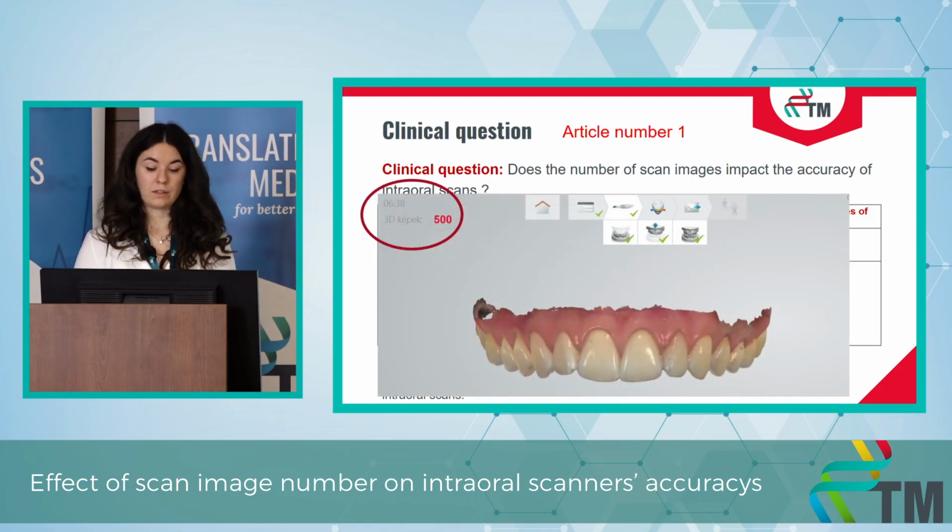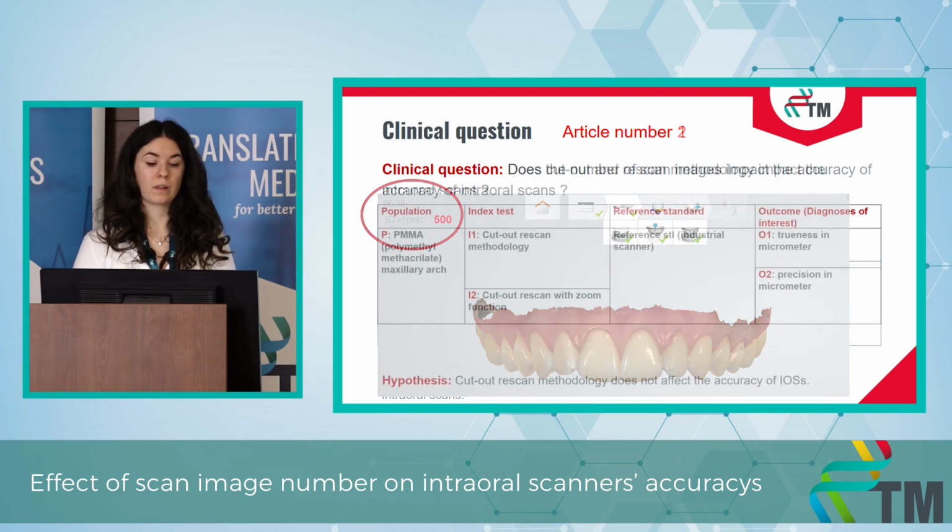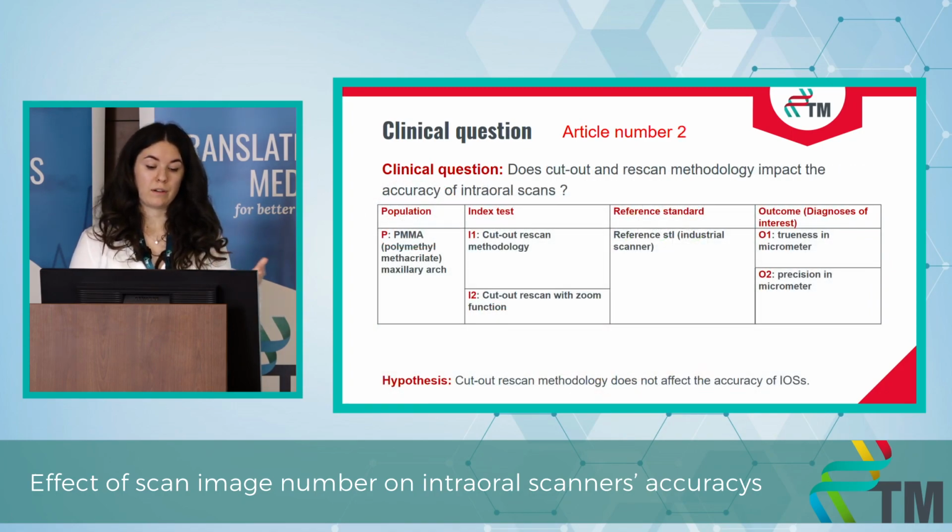So here you can see the software where we can find the number of images. We wanted to make this cutout rescan methodology as well, but we decided to leave this part for later, so I am not going to work with this now, but just with the first part.